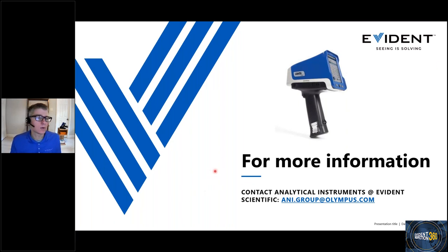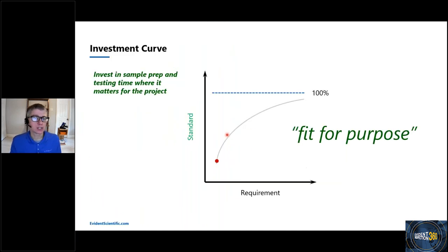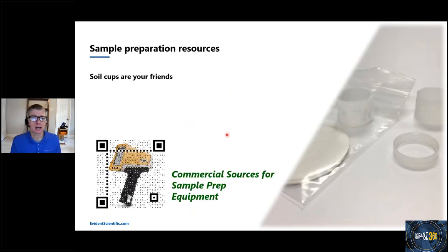Great. Somebody asked a question about how to make sample cups. That's a great question. I'll talk through this in general terms. I don't have any sample cups with me, but if you go to this link here, I have a set of videos about how to make sample cups. There's a couple components: the cup itself, the main body, a snap ring with some serrations on it, and then the clear film.